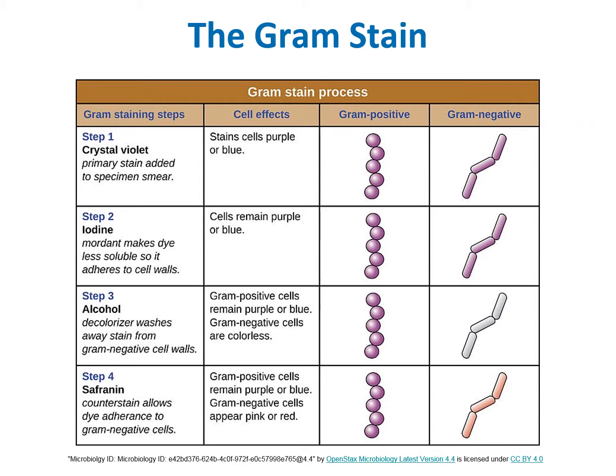The heat from the Bunsen burner denatures proteins on the surface of the bacterium, and this causes the bacteria to stick to the glass slide. This is important because if we don't do this step, when we wash the slide with several chemicals in order to color the bacteria, they would wash off. So we heat fix the bacteria to the slide so that as we pass all these chemicals over the slide, the bacteria stick a little bit better.